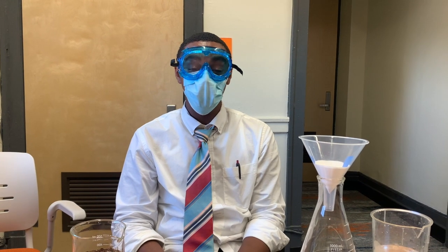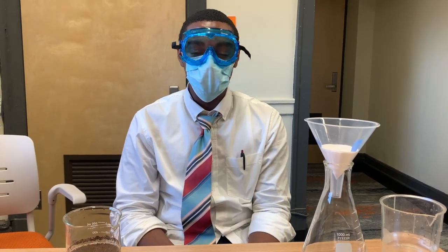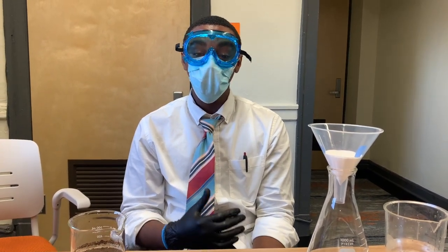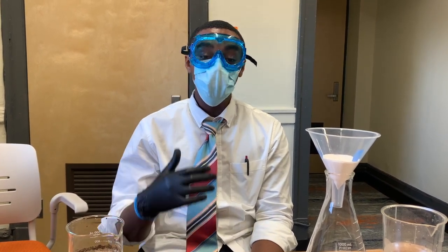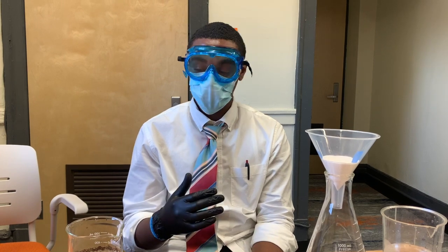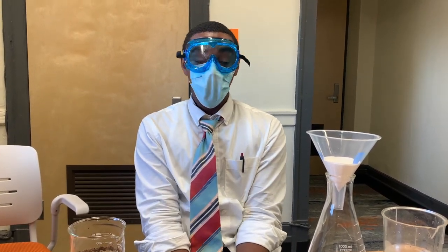Today's video is going to be on filtration, right? Filtration is a process that separates solid matter and fluid from a mixture using a filter medium that has a complex structure through which only the fluid can pass. So, pretty much all that's saying is we need to filter out the heavier things from the liquids.